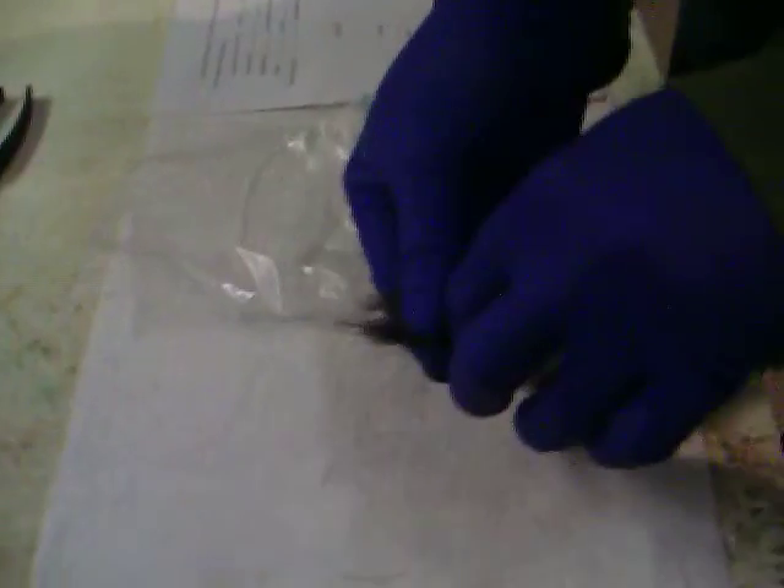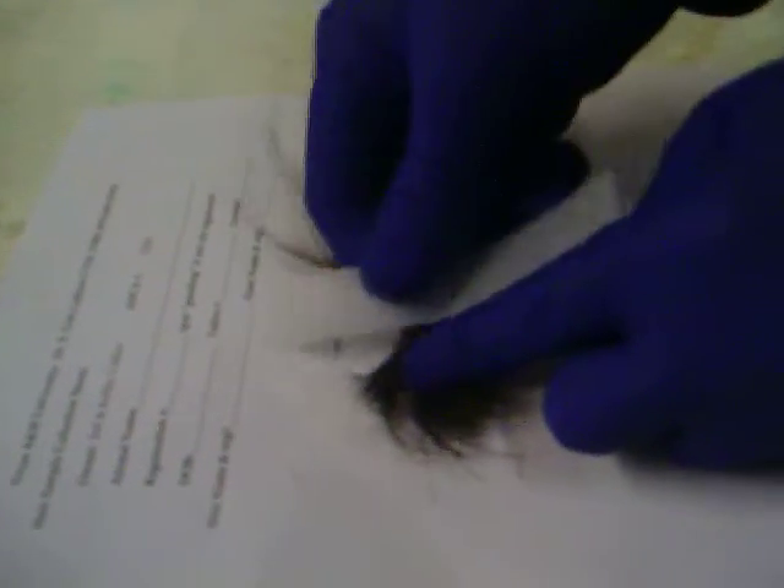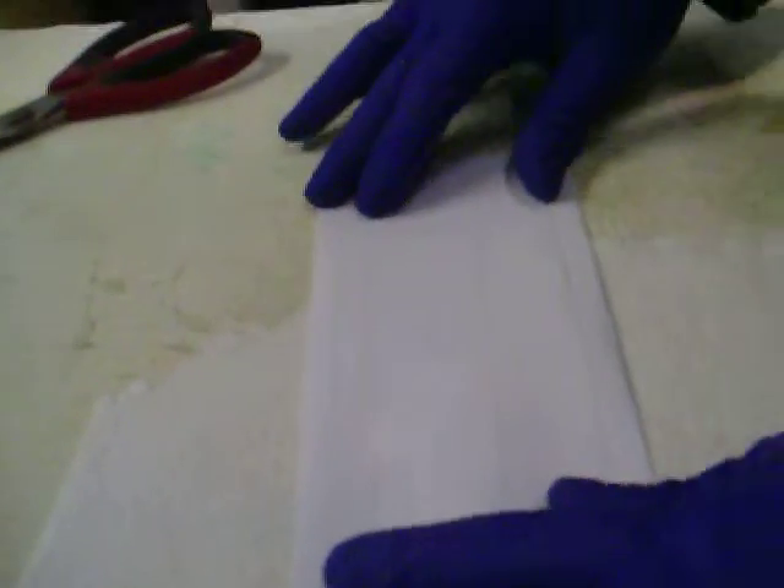You would either take this and wrap it with tape at about this spot and then place it in a Ziploc bag, or if you have a piece of paper, some labs have forms that they fill out or you can make your own. Just place it on the paper with the root ends on one side and you can actually cut the excess hair off — I think that's the dirty hair anyways. Then fold it up and send it in the mail, and that's as easy as that.